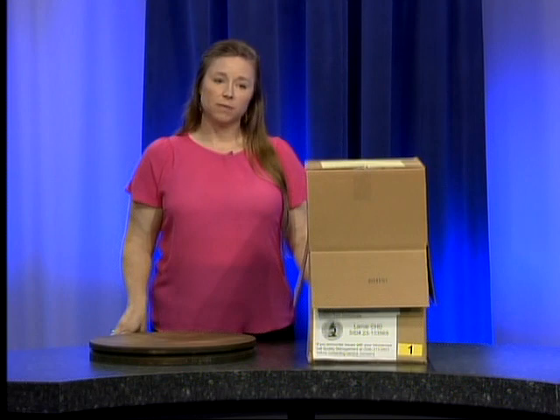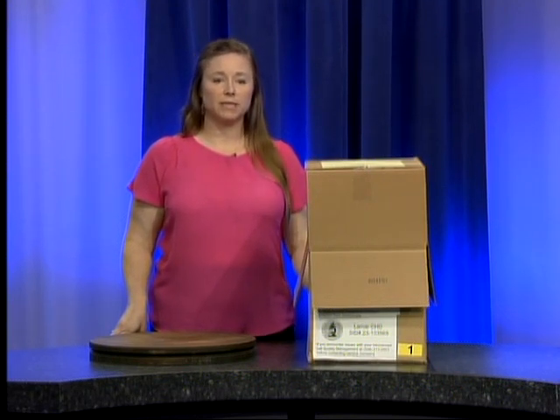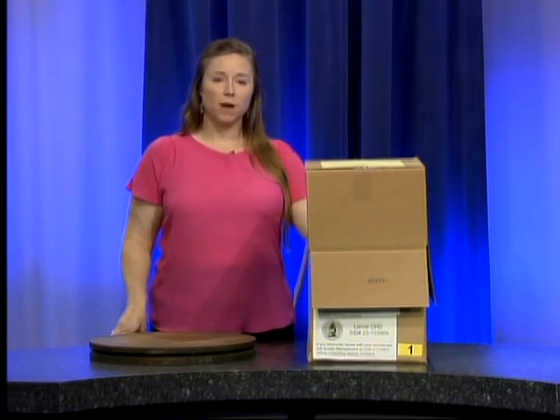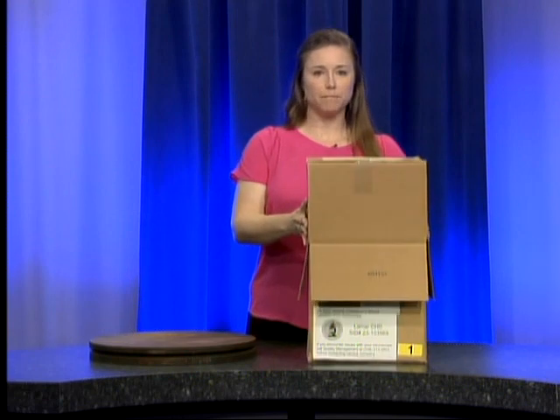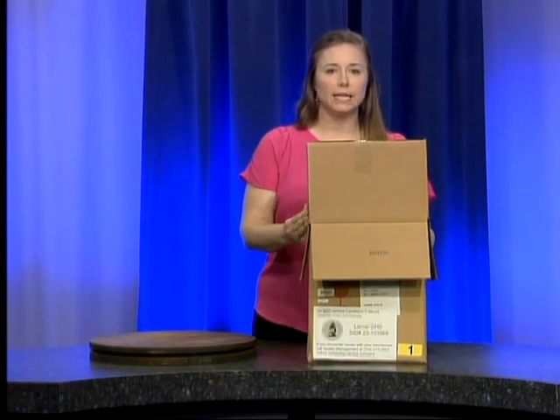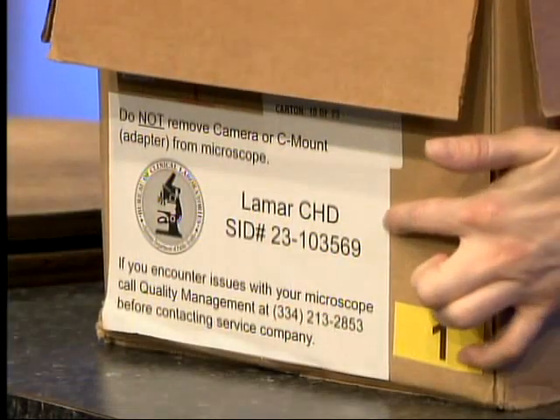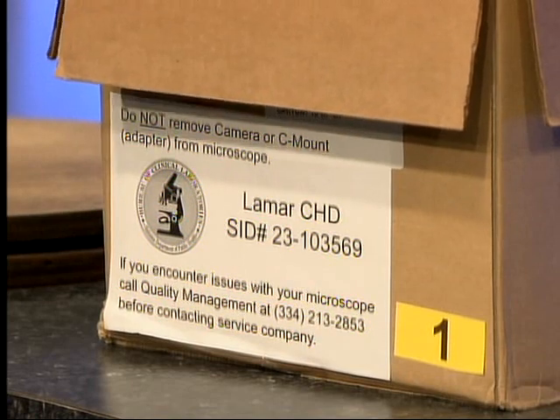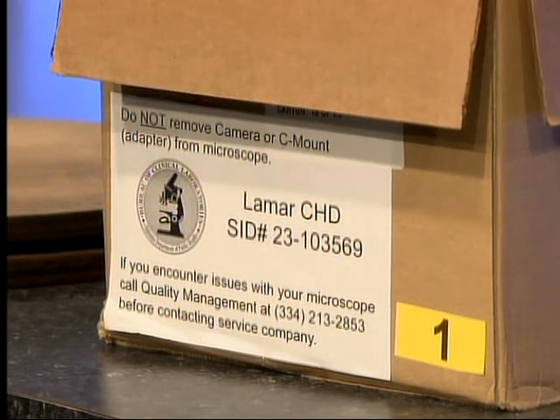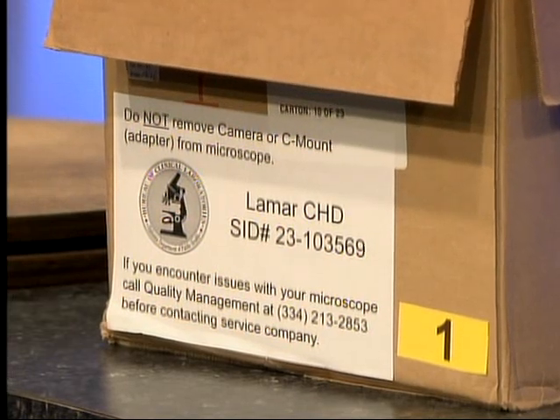Your microscope will be delivered very soon and it's going to be delivered by a technical consultant like myself. It's going to be in two boxes — the top one's going to be upside down. On the front you will see a white label, and on the label should say the County Health Department of where you are. If that County Health Department on the label does not match where you are, please let us know because you've probably gotten the wrong microscope.